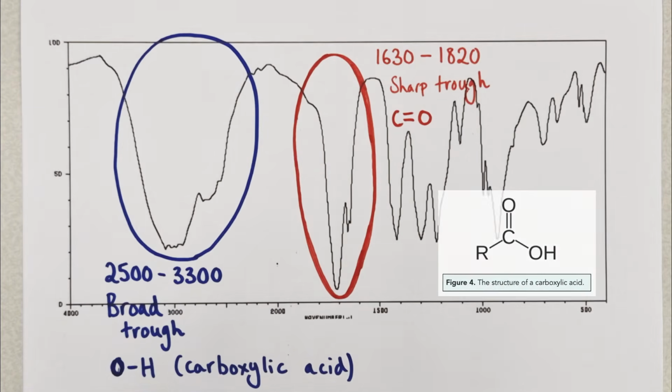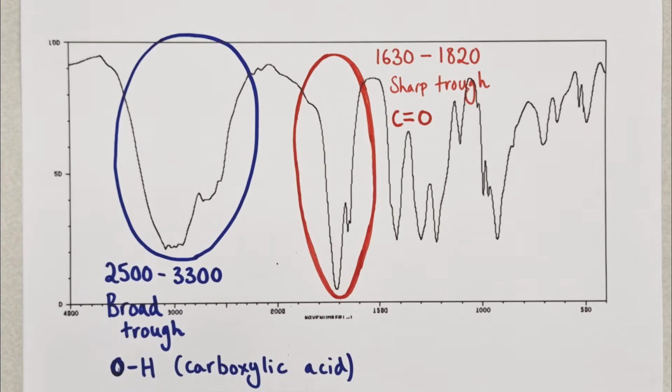So it would seem to be very much lining up with our expectations that this molecule is most likely going to be a carboxylic acid. Now, two data points are supporting that conclusion.